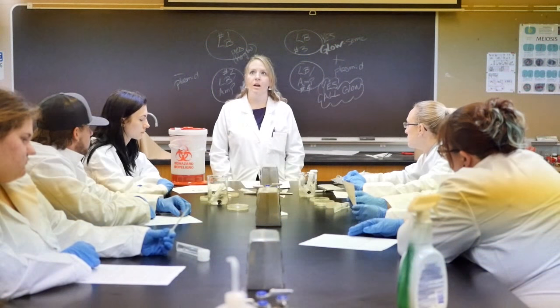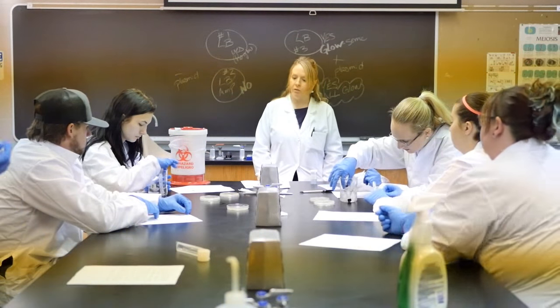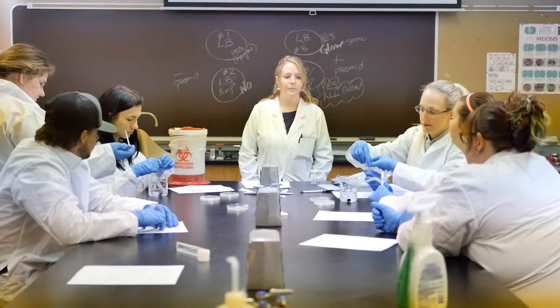Let's see, so it's been a couple of minutes. Let's go ahead and add in Luria broth. You should have a sterile pipette in front of you. Add in 250 microliters of Luria broth. That's the same measurement as the calcium chloride. Don't make me measure.